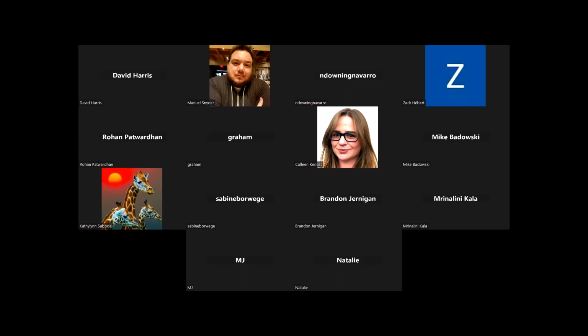So they can build their own list and say, here are the ones we want pulled for you. Is it possible to have them work with a copy? No, they don't really need to work with a copy. They have different permissions. They will only have read-only permissions, so they can see the specimens, they can filter the specimens, but they cannot edit any information related to a specimen.